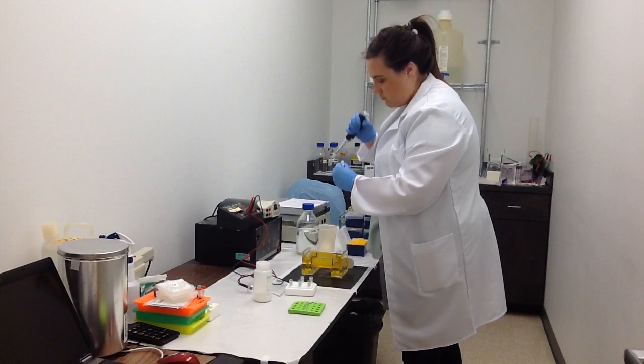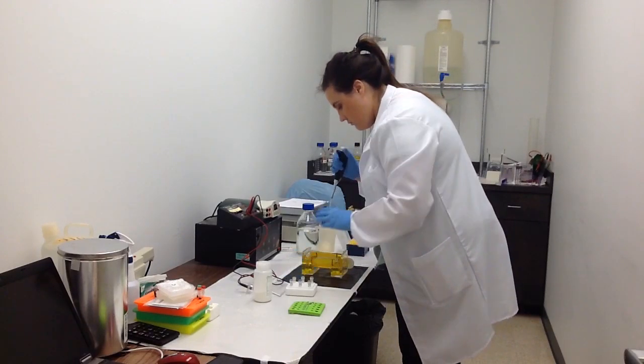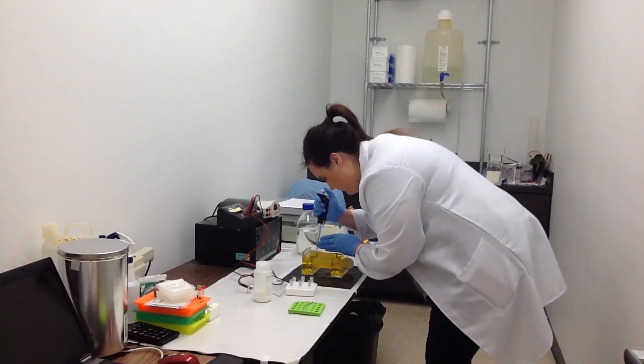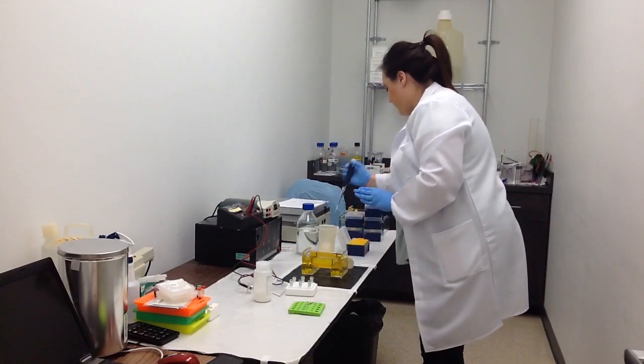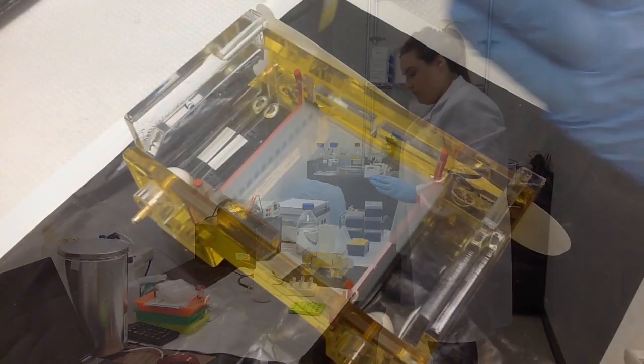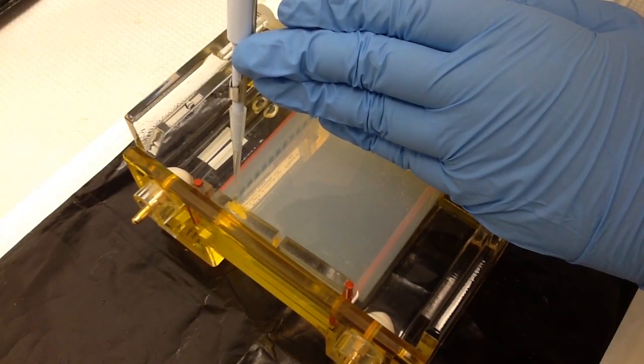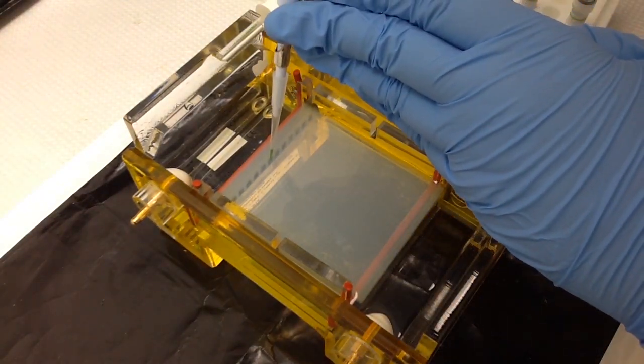First I'll be loading our 50 base pair ladder into the first well. I am right handed so I usually use that hand to depress the plunger of the pipette, while my left hand is used to stabilize the process. My left elbow or wrist is touching the bench or the gel rig to anchor me and keep my hands stable. Using my left hand as a stabilization tool will help me not to pierce through the gel with the pipette tip.